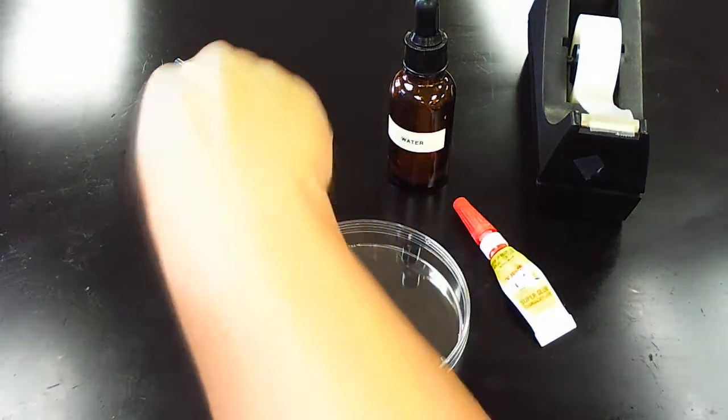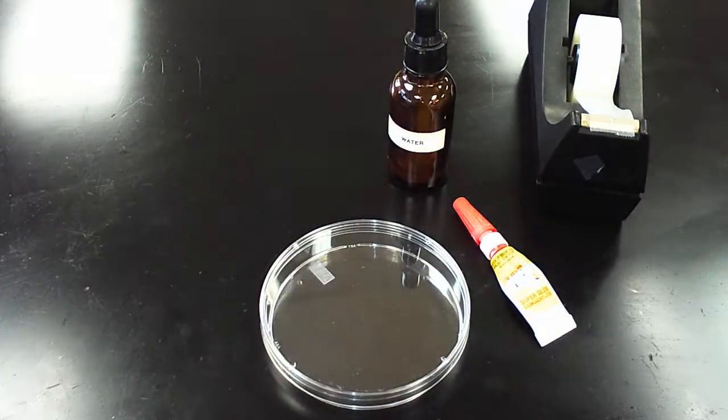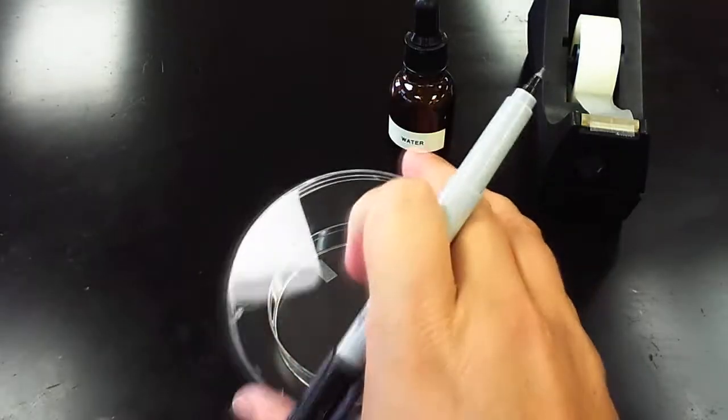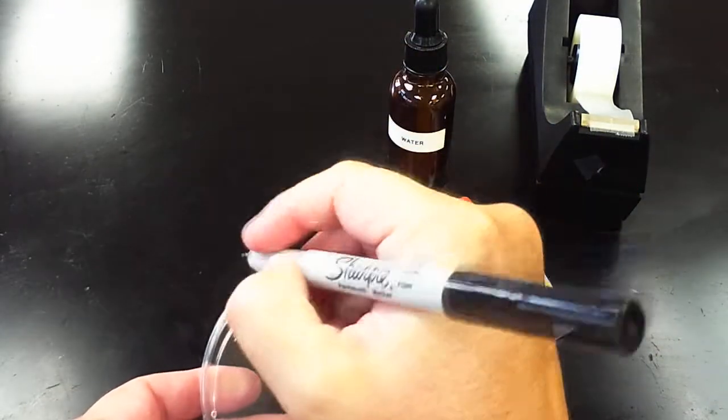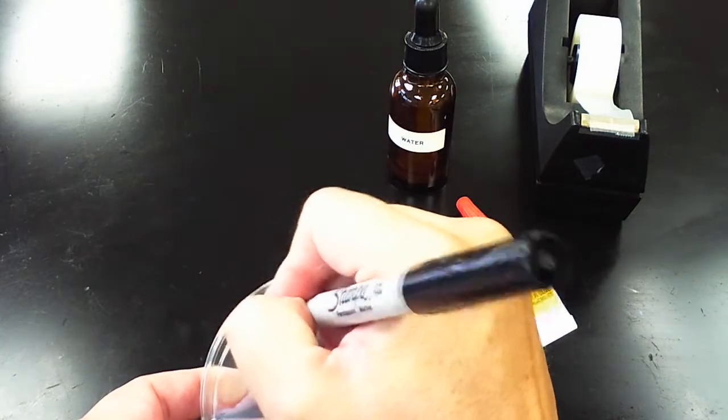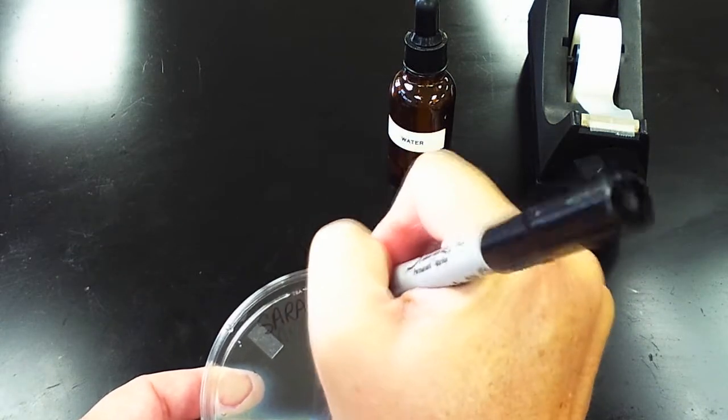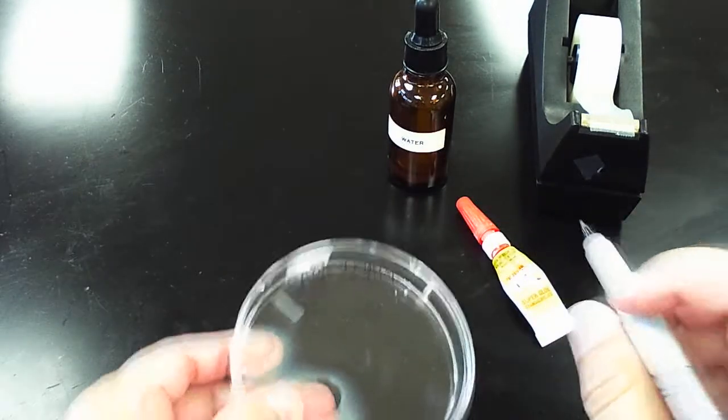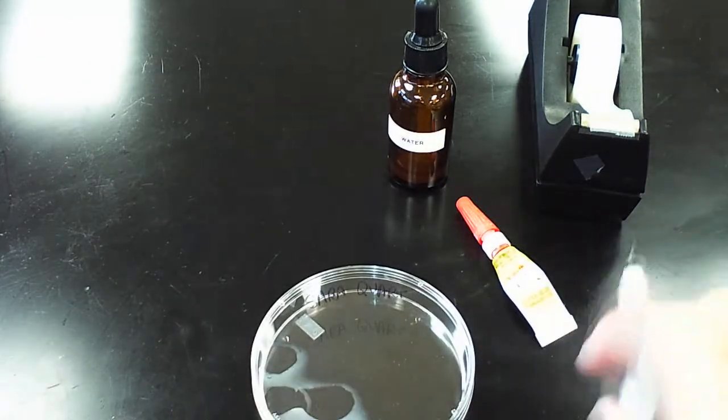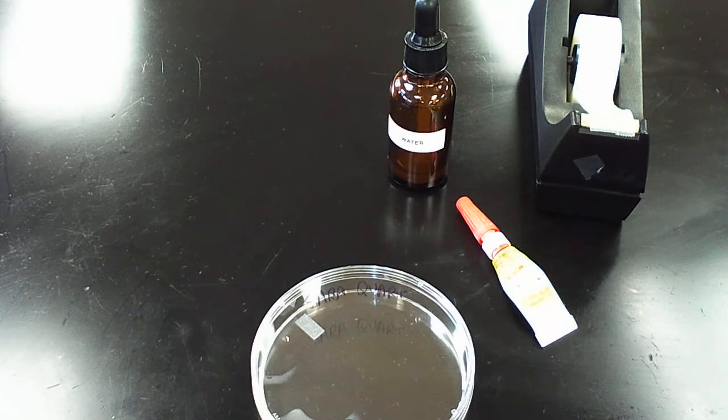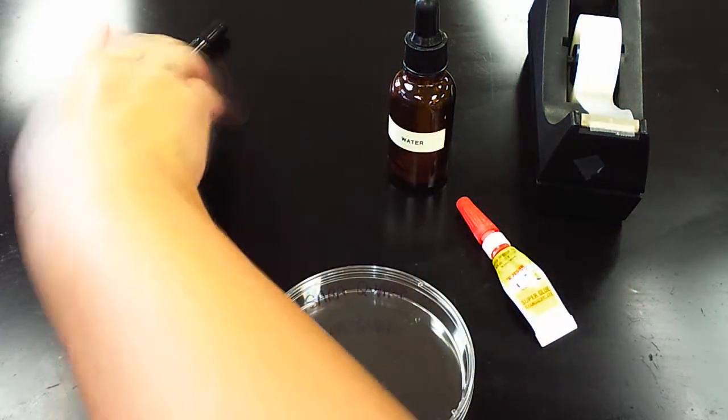The first thing I want you to do is take the sharpie marker and on top of the petri dish write your name, first and last please. That way we can keep track of everybody's fingerprints. That's the only reason why you need the sharpie.